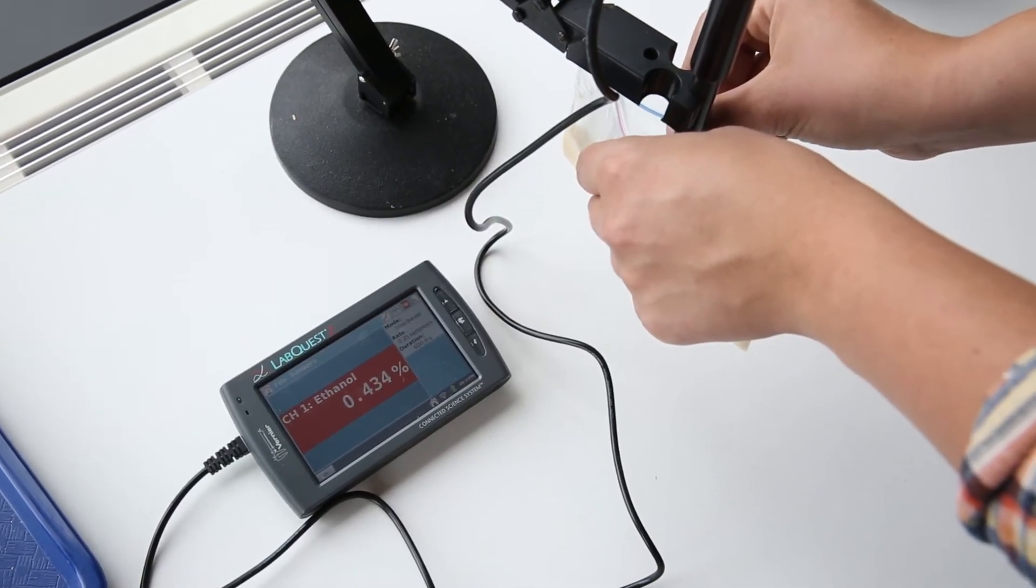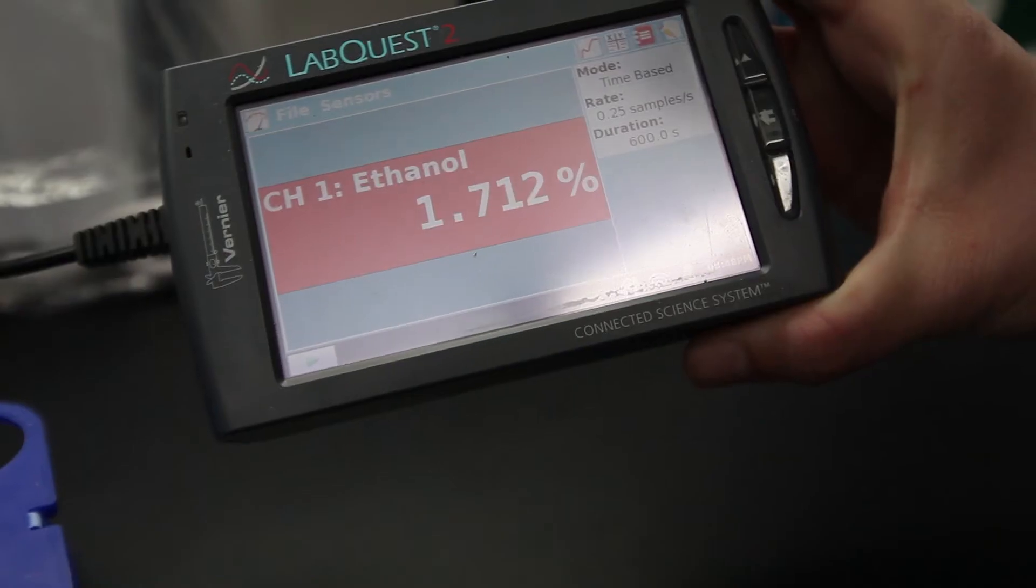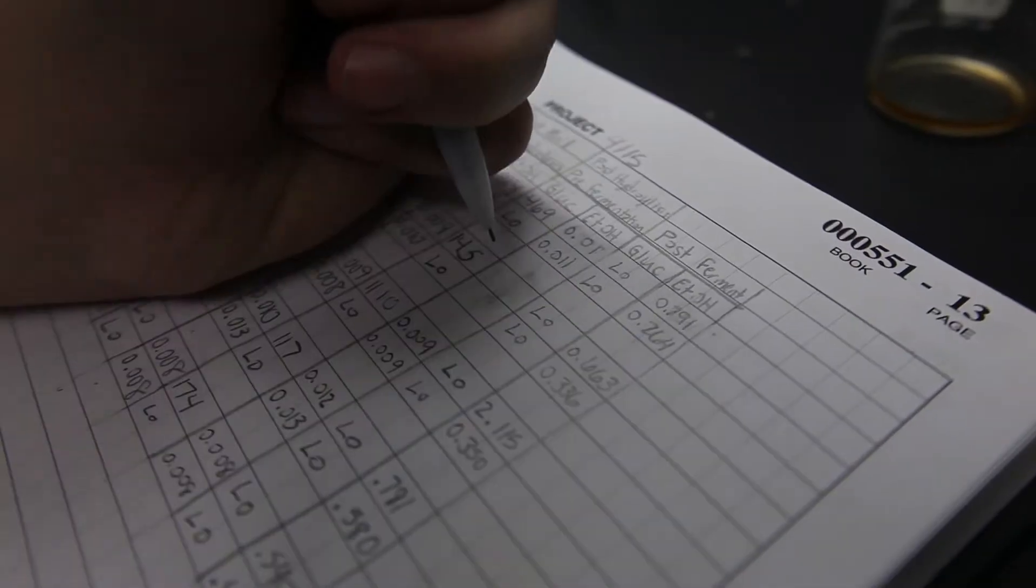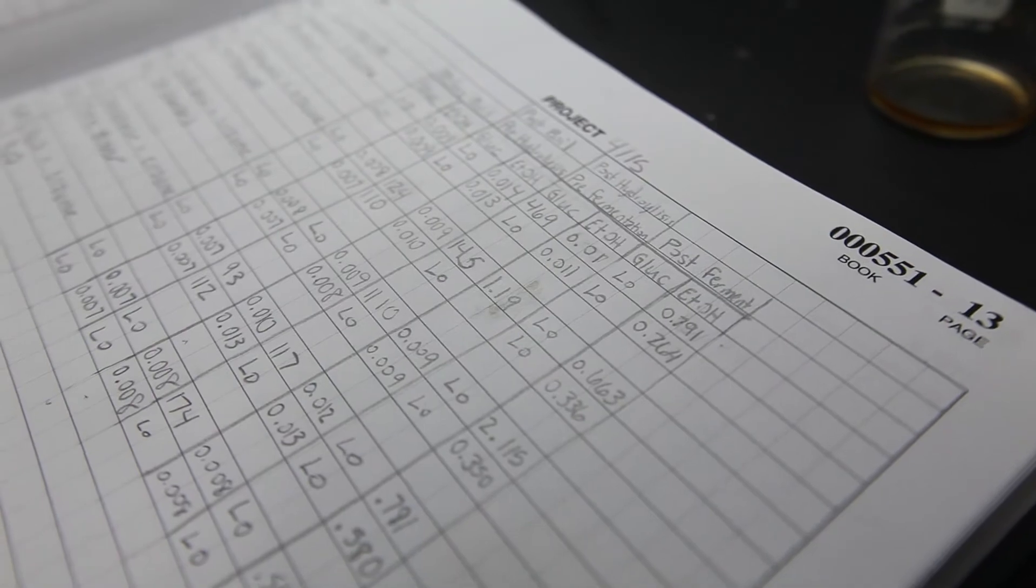These sensors are good for showing qualitative changes in ethanol. Both human and instrumental error can make quantitative comparisons between samples difficult. This video will provide tips on how to take more accurate measurements and make more meaningful comparisons.